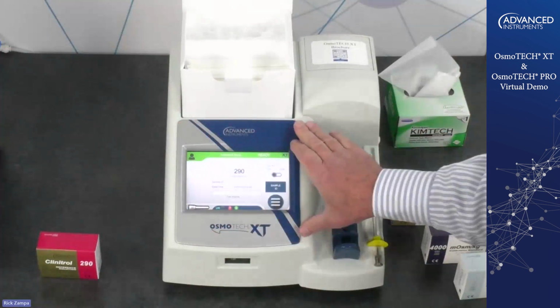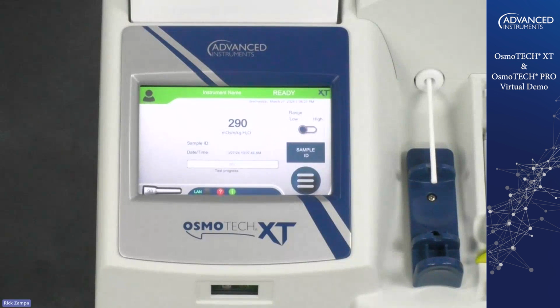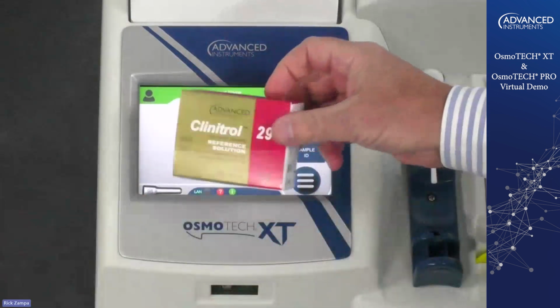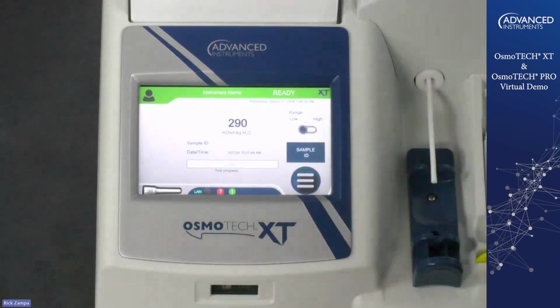Right here, I'm just going to show you how easy it is to run a test right now and how quickly we can run a test. And then I'm going to talk a little bit about osmolality. I'm going to zoom in a little bit here so you can see a little bit better as I run a test. There we go. So now what I'm going to do is, like I said, I'm going to run a test. I'm going to take some of our 290 reference solution here. So I have our 290 reference solution.